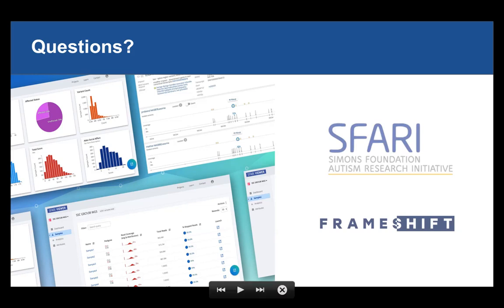Okay, thanks. And is it possible to share visualizations with colleagues? Yes, it is. So to share any visualization or any page, it's really straightforward. You just copy the link and send the link over to your colleague. And as long as they have access and they're already logged in, the link will pull up as shown.